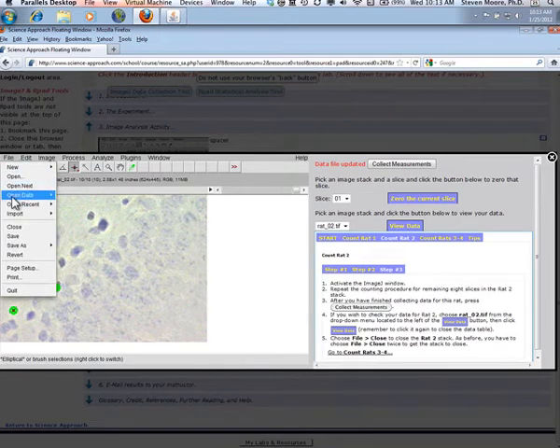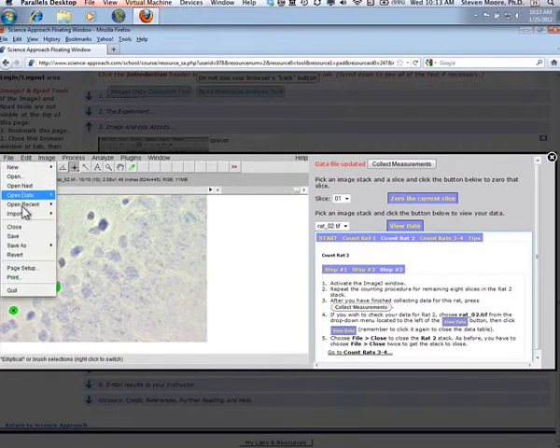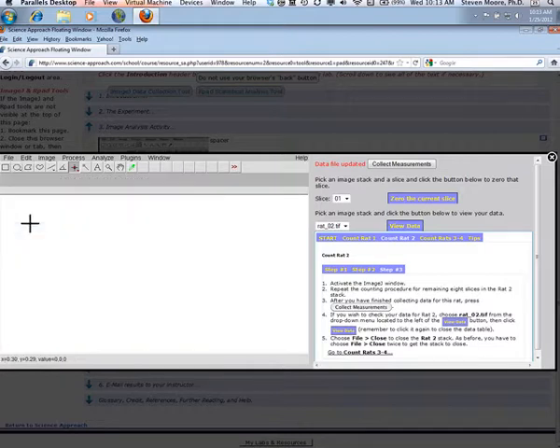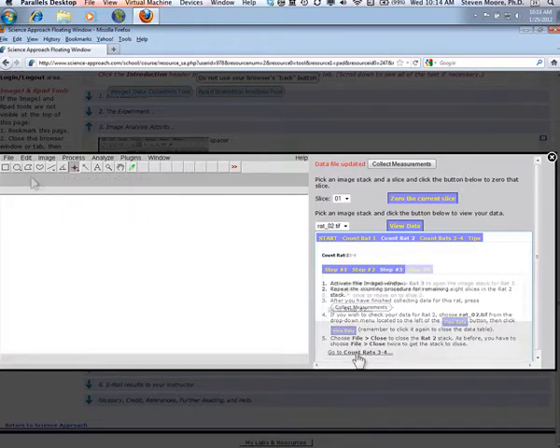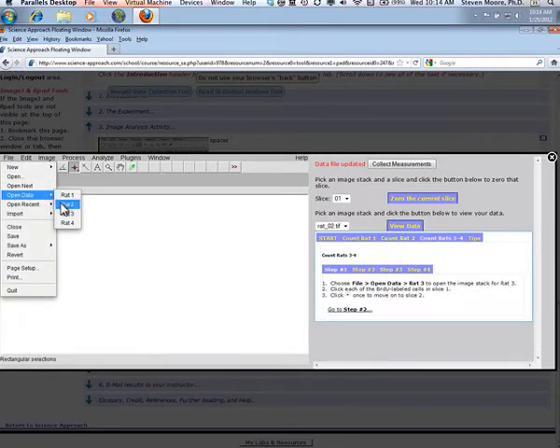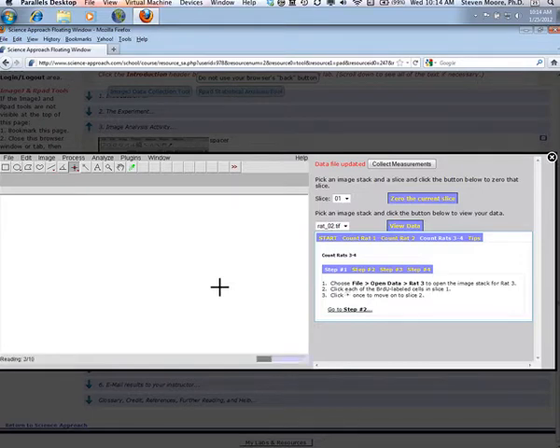Then choose File, Close twice to close the stack and start all over again for the third stack. Choose File, Open Data, Rat3 to open the image stack for Rat3. Then click on the BRDU labeled cells as you did before.